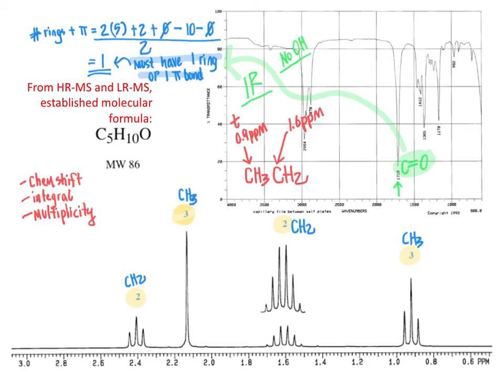And the signal that we see here definitely exceeds a quartet, which is what we would predict if the only vicinal hydrogens to the CH2 group were the CH3 methyl protons. We would expect the signal for this CH2 group to be a quartet, applying n+1, where n is equal to 3, plus 1 makes 4, which is a quartet.